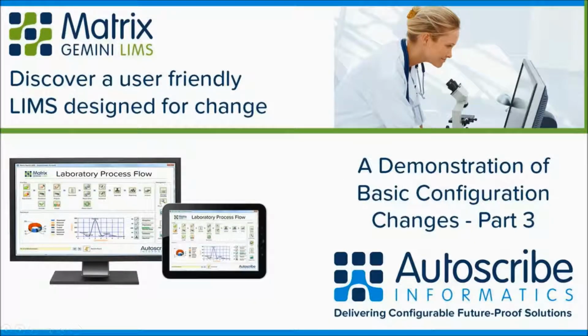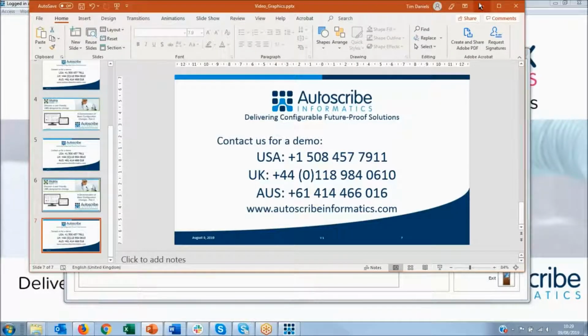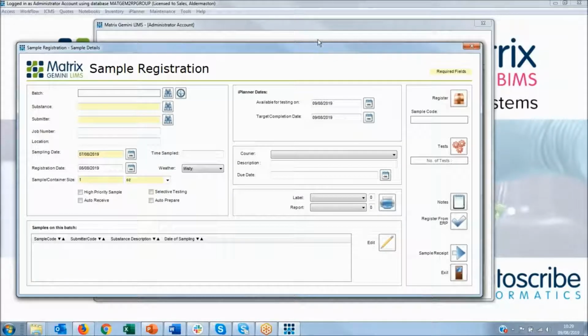Hello and welcome to part 3 of basic configuration changes in Matrix Gemini LIMS. What I wanted to show today was a little bit more detail on auto-generating screens and controlling changes.